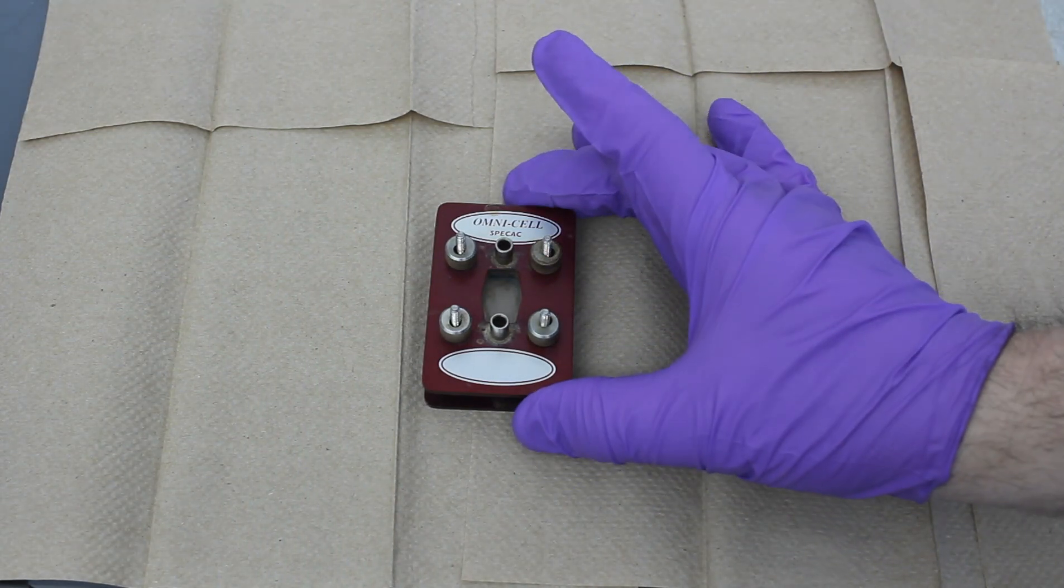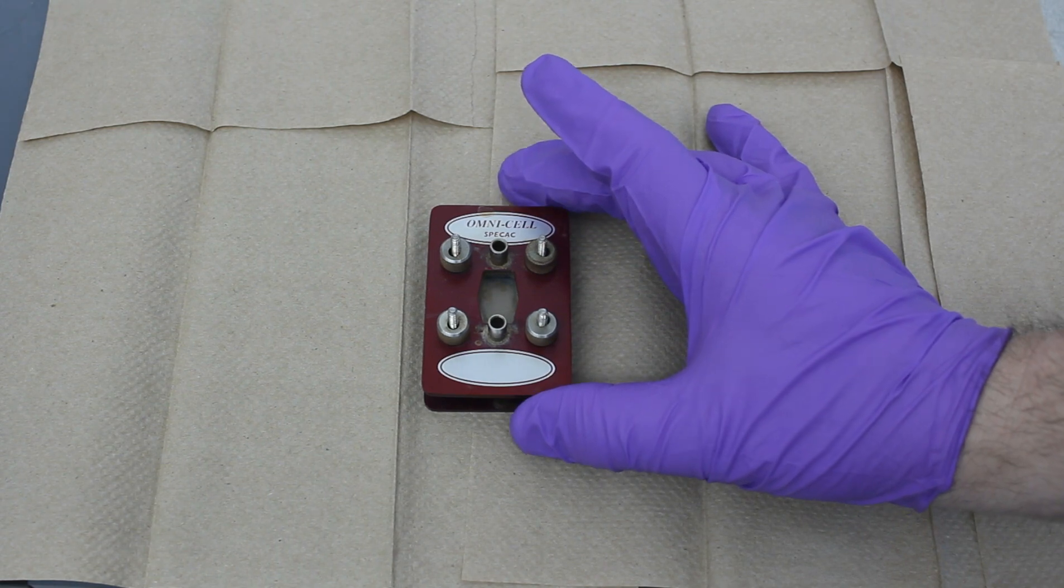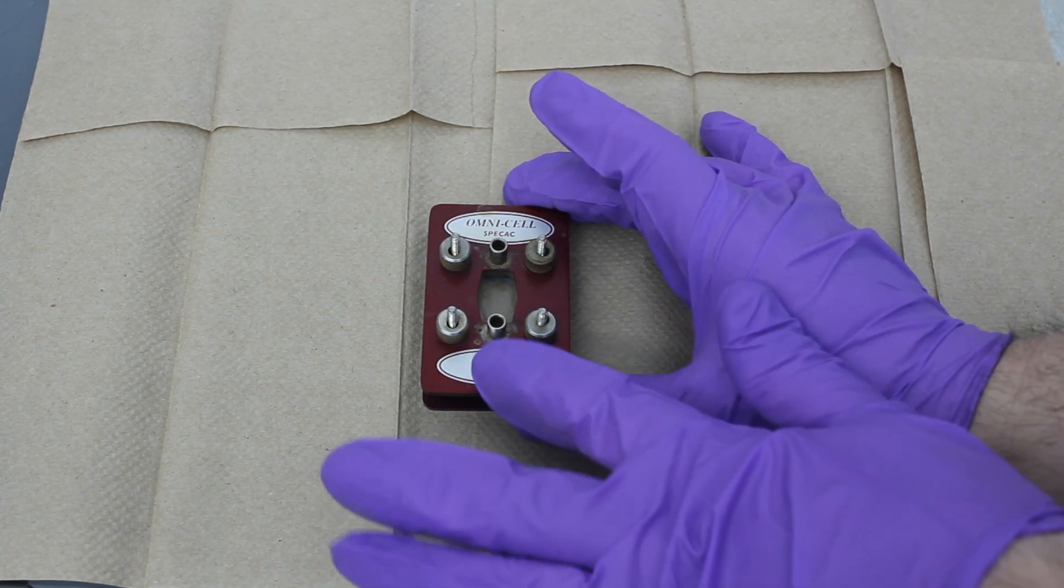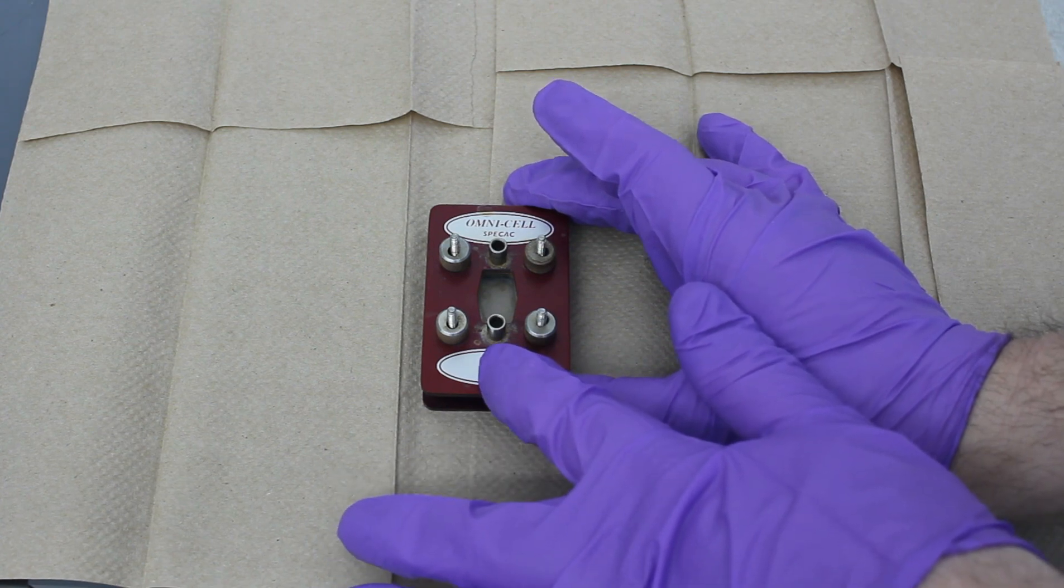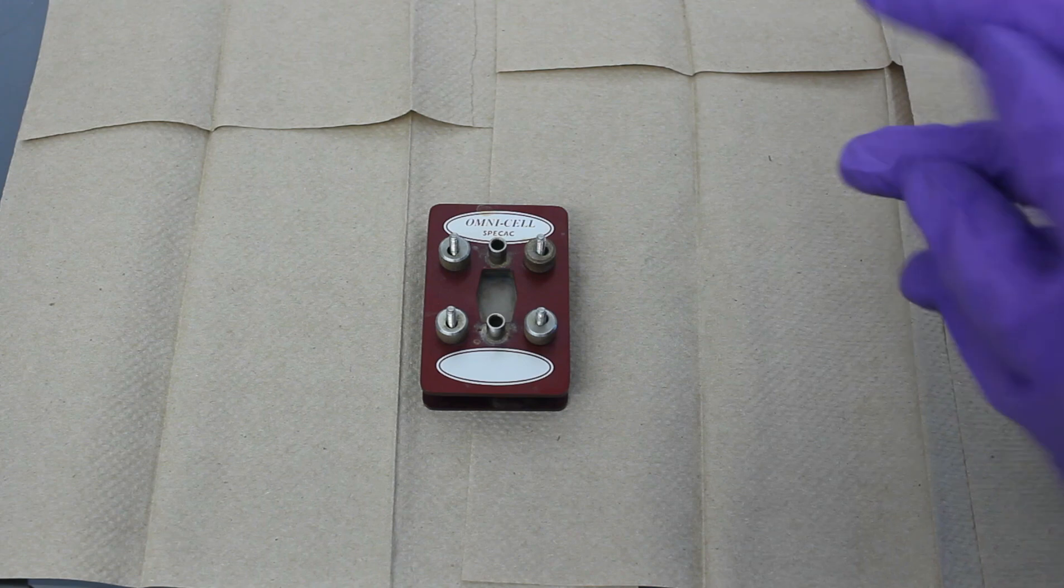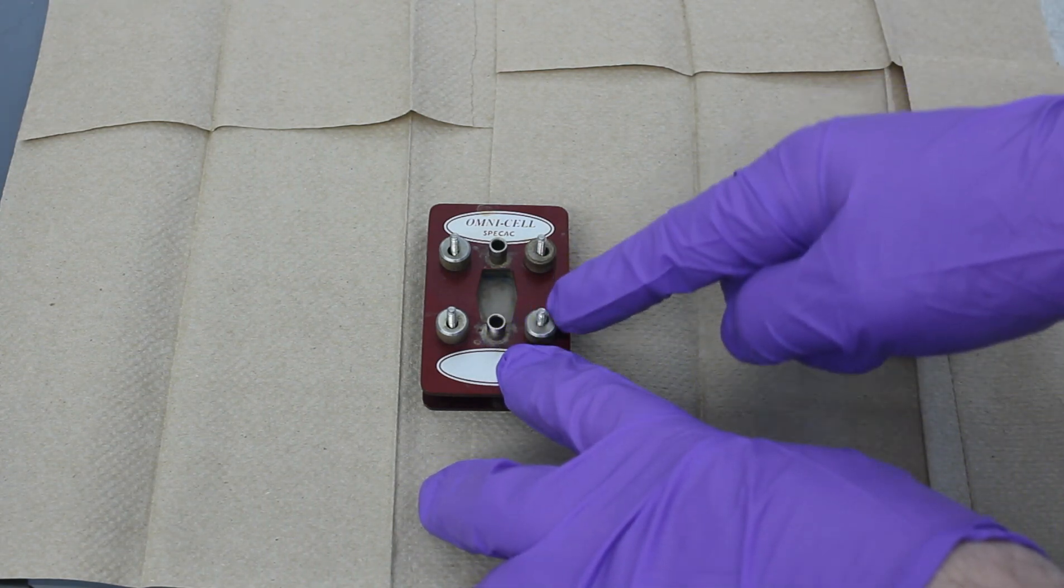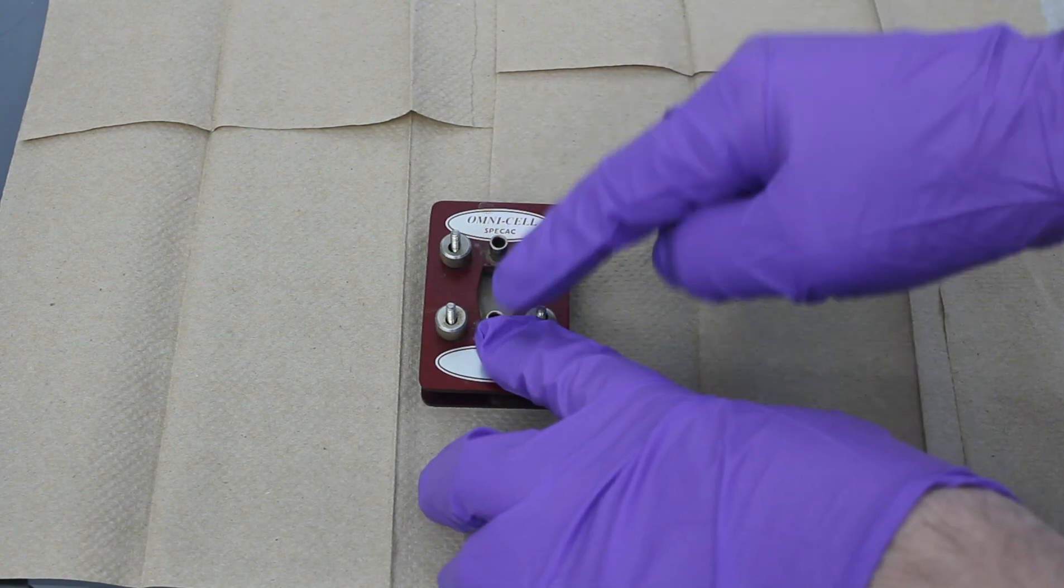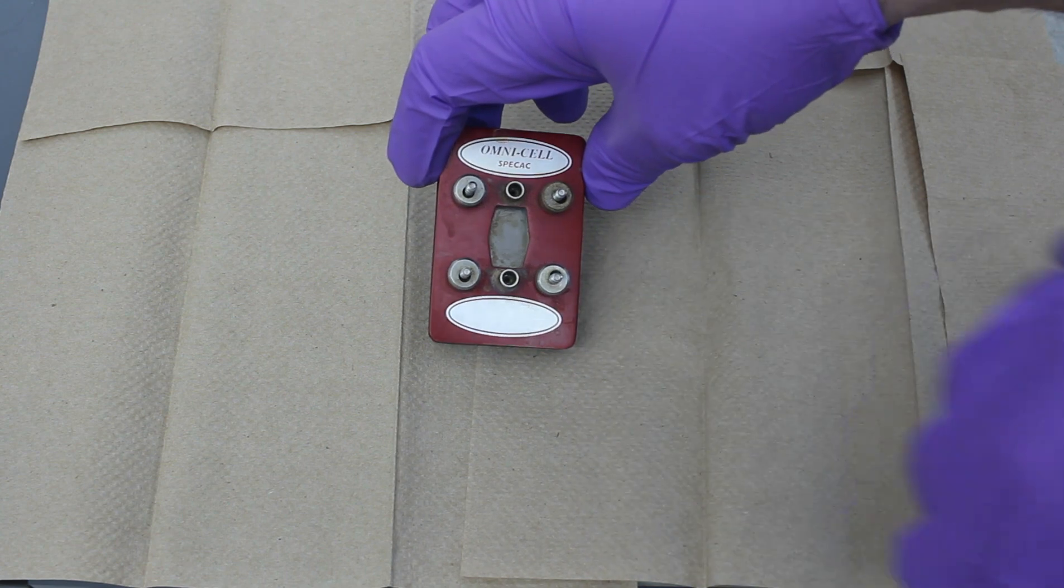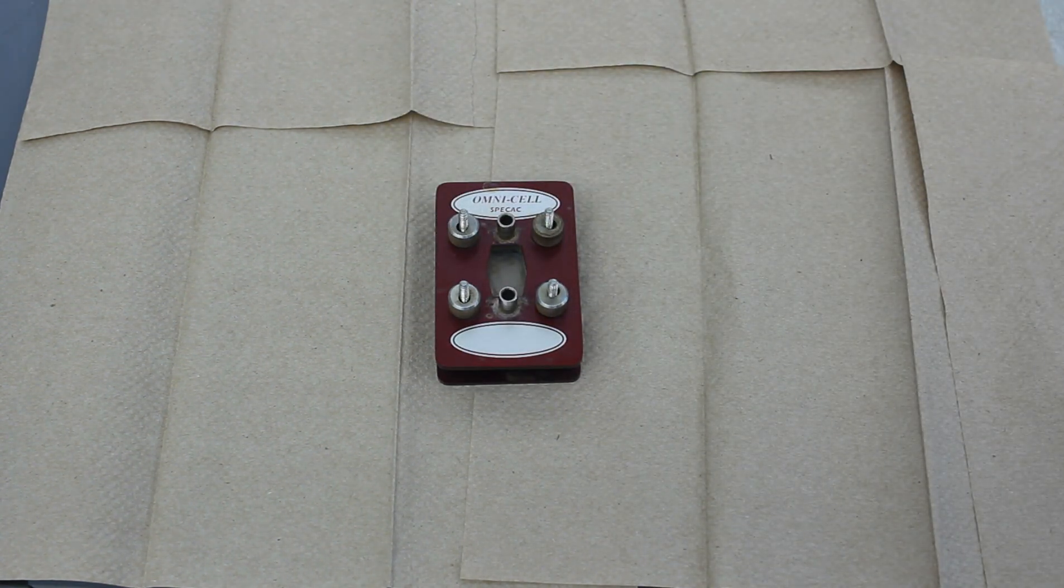This is an FTIR flow cell, an infrared flow cell. I work with air-sensitive compounds, so we have a solution that's being pressurized with argon or nitrogen, goes through the flow cell and out—inlet, outlet—and then through this window. In this case, a sodium chloride window, we use that to collect our data.